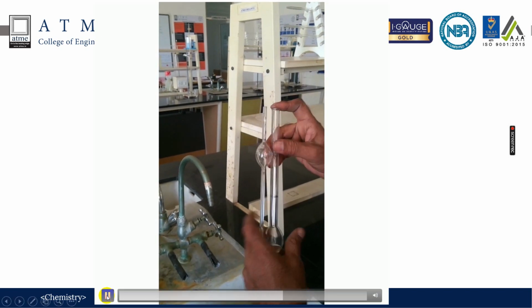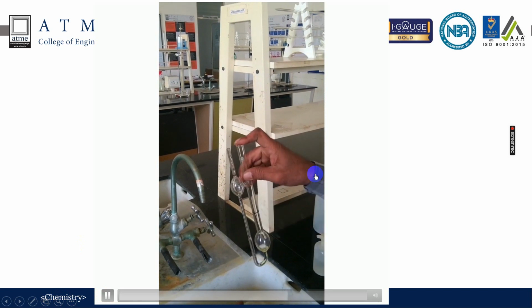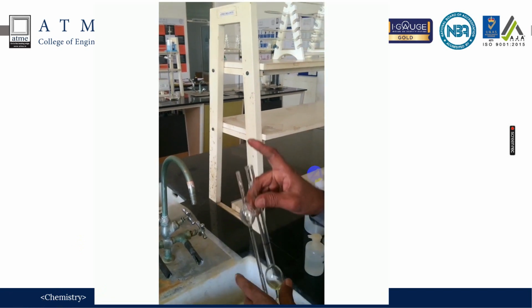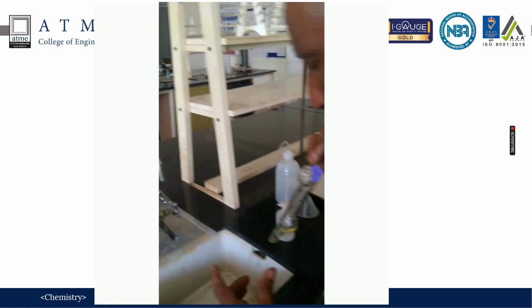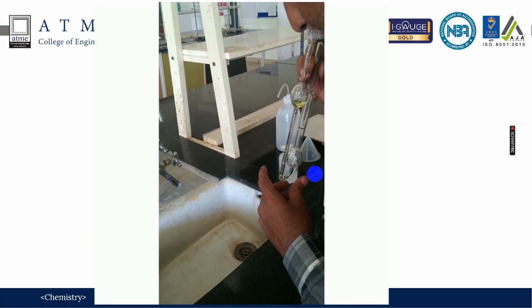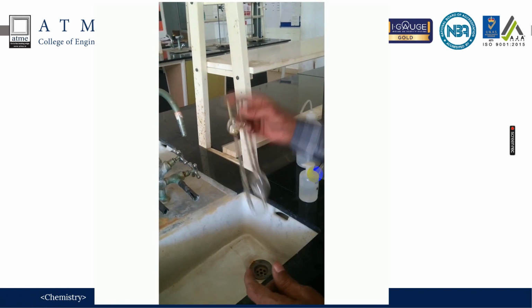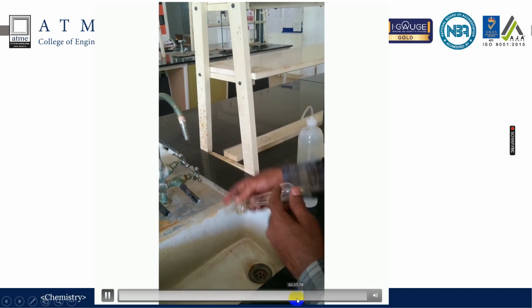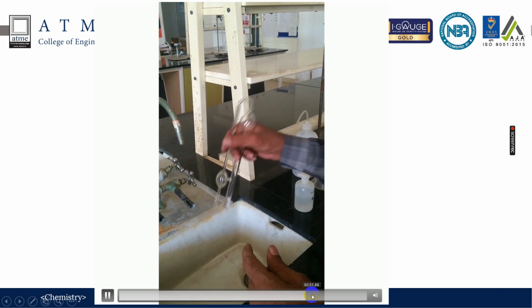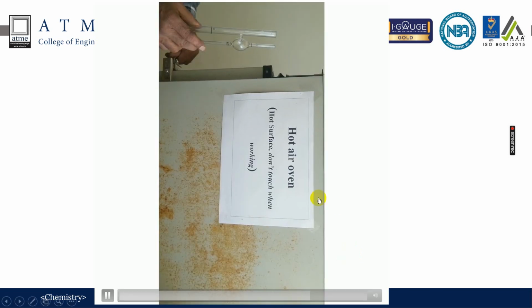After this trial, you just rinse the Ostwald viscometer with acetone. The reason is to make sure all the lubricant or oil has been cleared. Now, as a reference, the same procedure is followed.